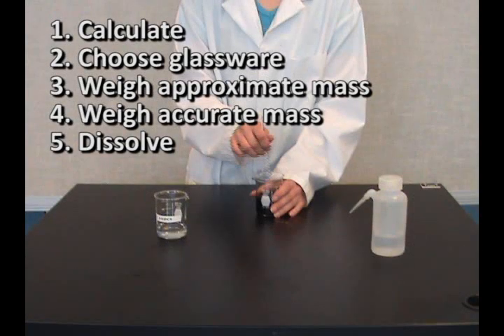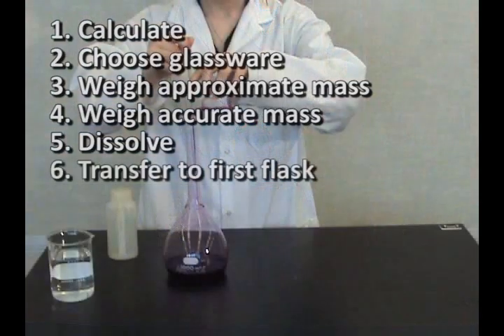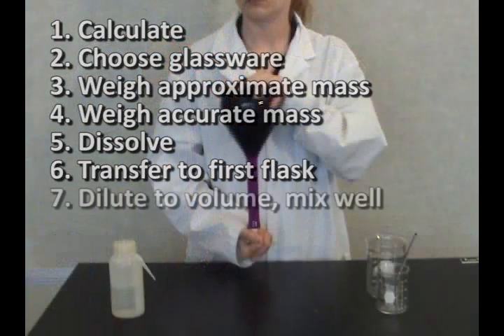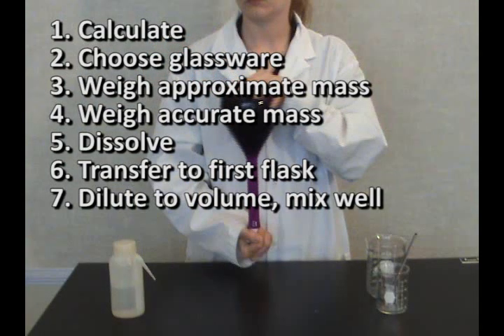Dissolve the potassium permanganate. Transfer to the first flask to be used in the dilution using the glass rod to pour. Dilute to volume, invert, and mix at least 15 times.